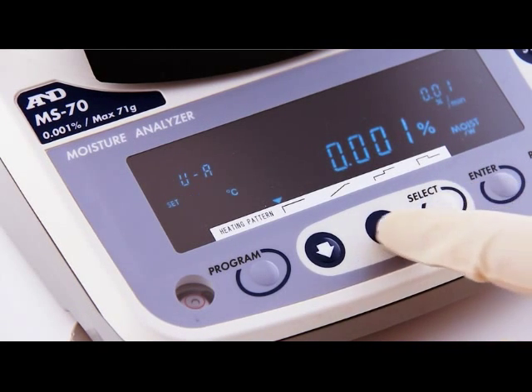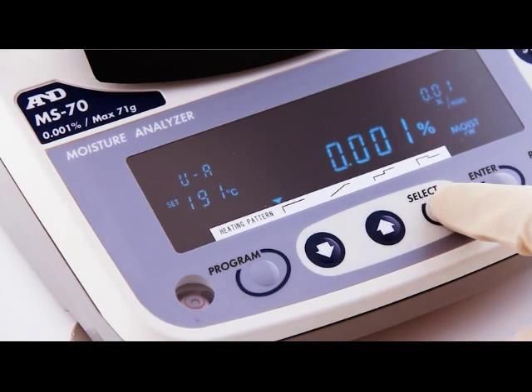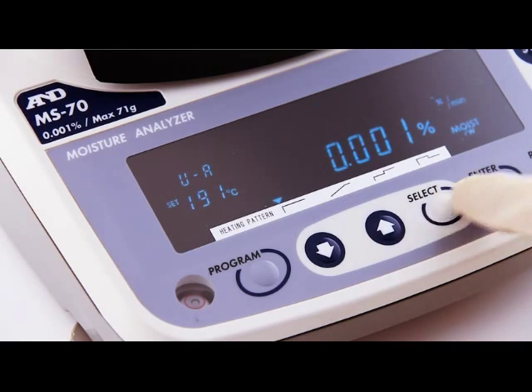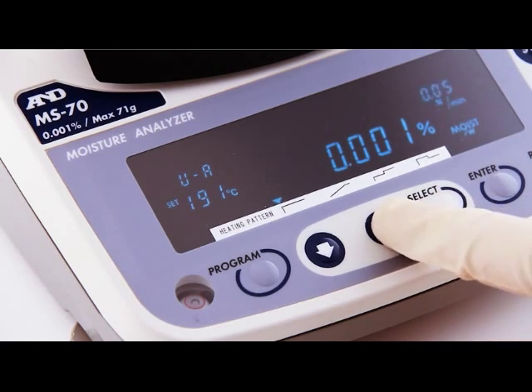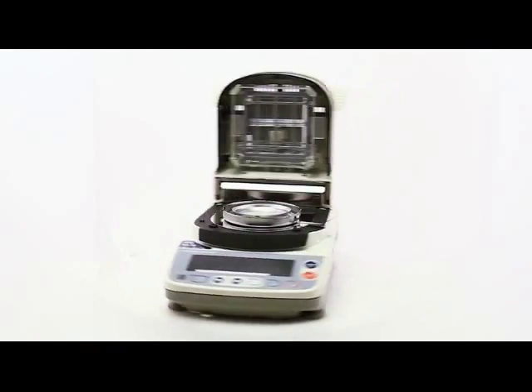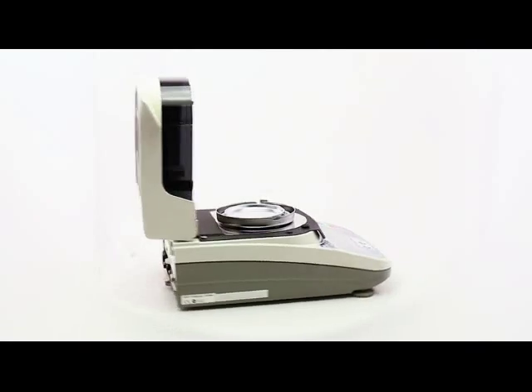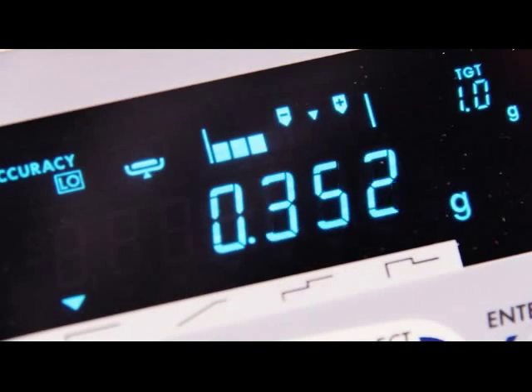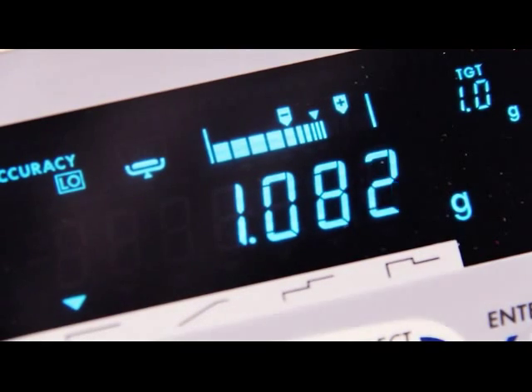By setting the temperature and the final drying rate you can establish a repeatable process. A range of intelligent features helps assure accurate results.